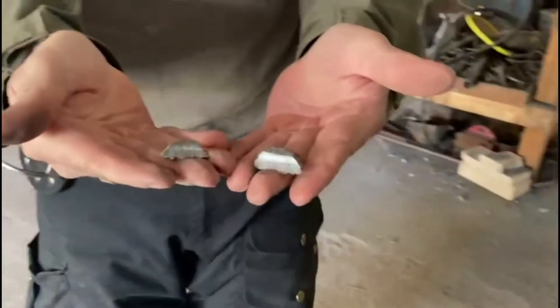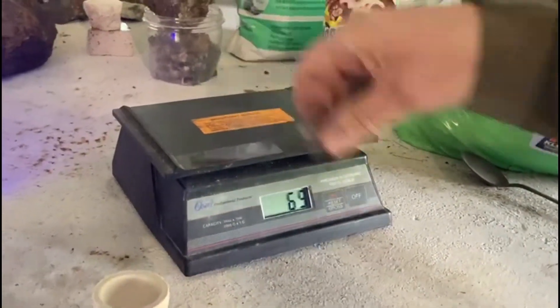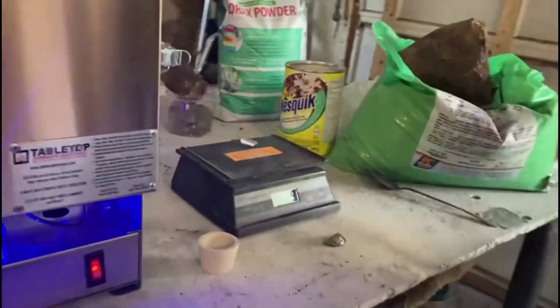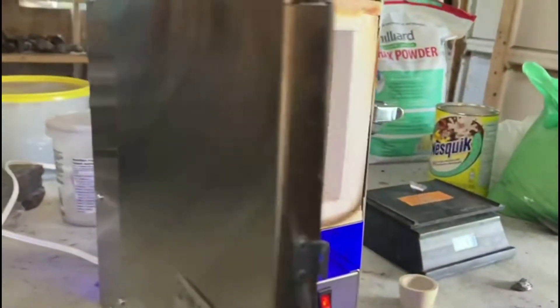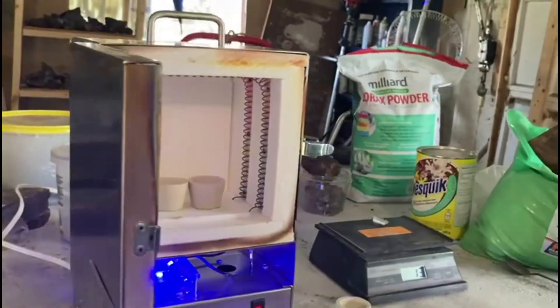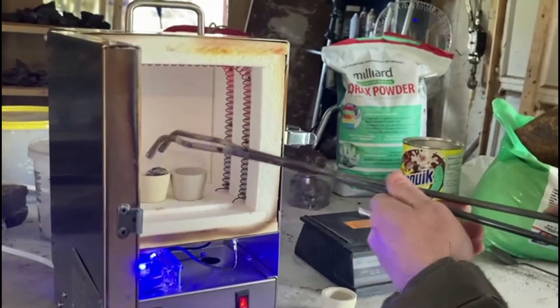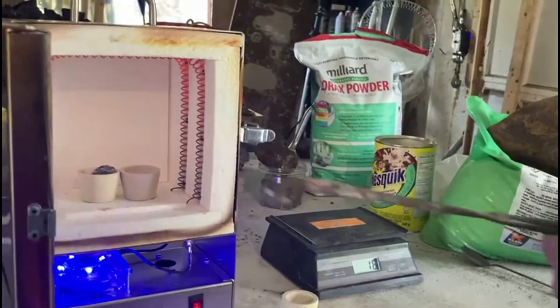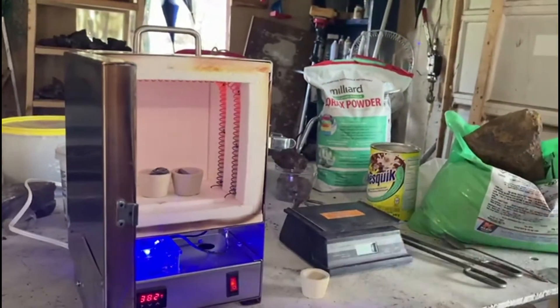We'll put each of those on a capel. That one is 23 grams, no problem. And that one is 14 grams. Got the capels warming up in the furnace already. One. And two. Now we wait.